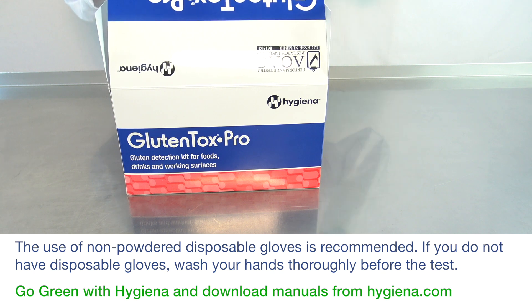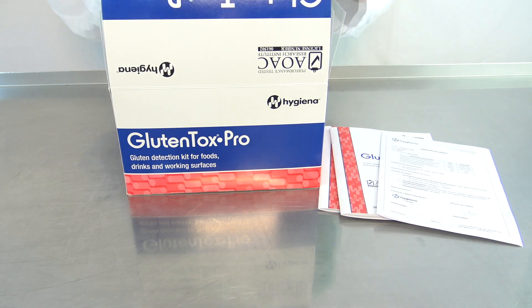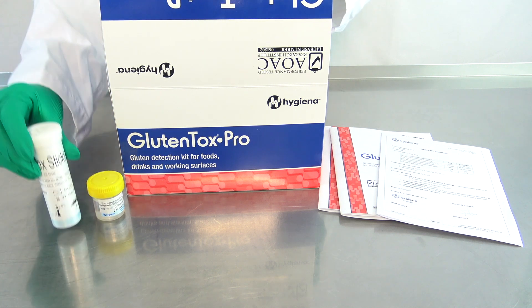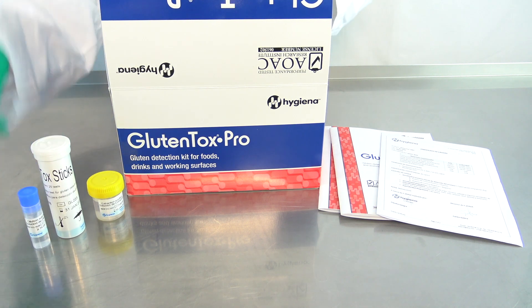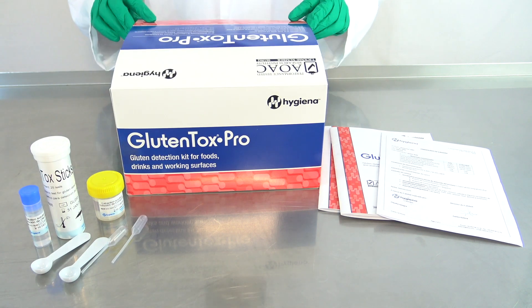When opening the box, you will find manuals, a quality certificate, extraction solution with a yellow cap, gluten test sticks, dilution solution with a blue cap, disposable spoons, and plastic pipettes.